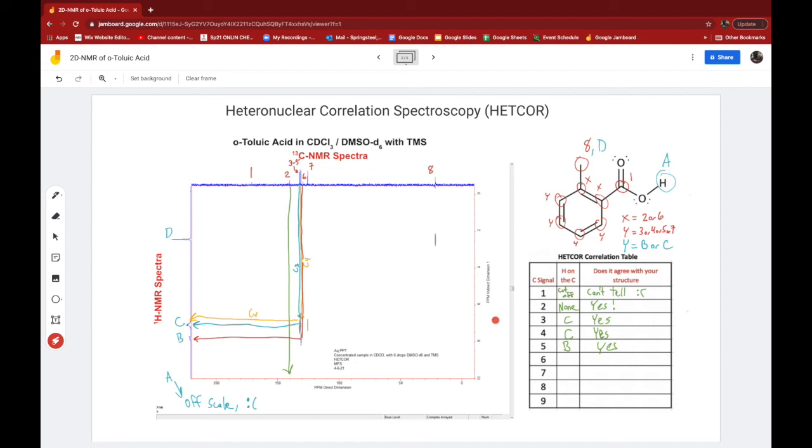All right, and now let's go to 6. 6 is the short one, huh? And it looks to me like 6 is not corresponding to anything. So, actually, I'll label this carbon 5 as the red one. Carbon 5. So 6, I'll do it in black. So 6 is just coming straight down, and it's just missing everything, huh? 6 is like 2. This is carbon 2, huh?